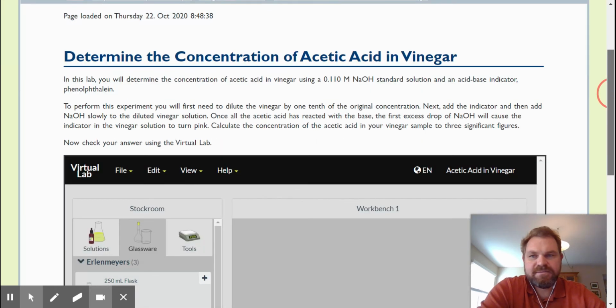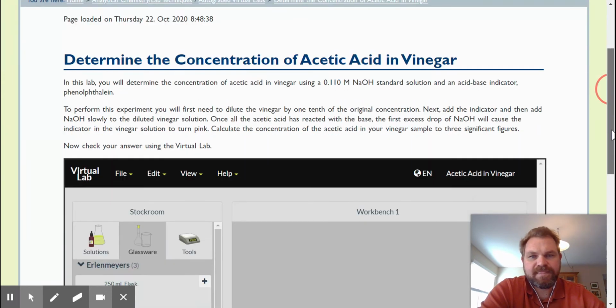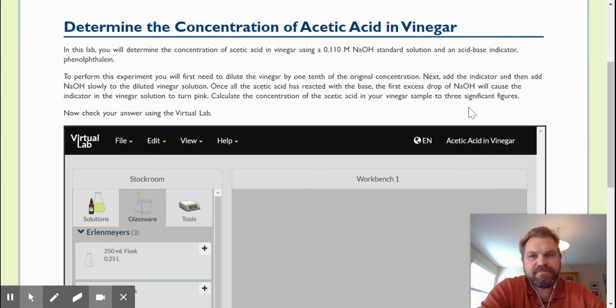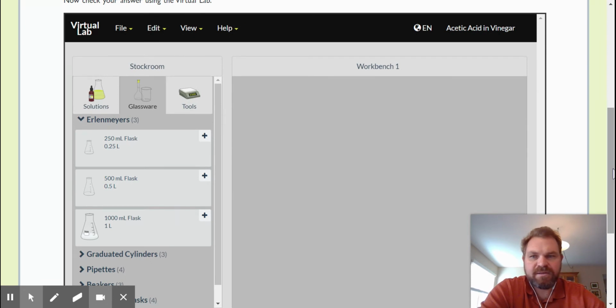Hello, everyone. Today we're going to look at how to do a titration experiment where we titrate acid in vinegar using this Chem Collective online simulation. In this experiment, we neutralize the acid by adding a known amount of base, and that allows us to then determine the amount of moles in the volume of acid and therefore the concentration of the acid, in this case, vinegar. And so the acetic acid is what is in vinegar that makes it acidic and sour tasting.